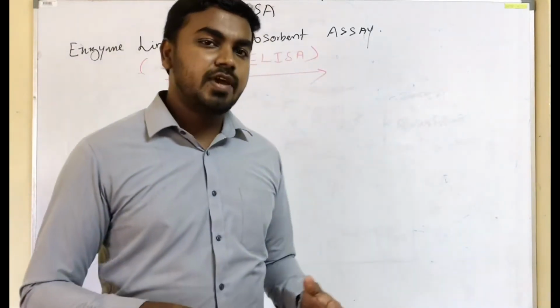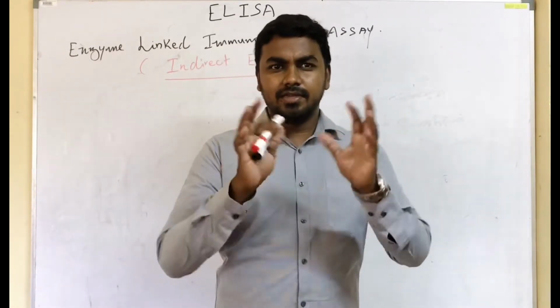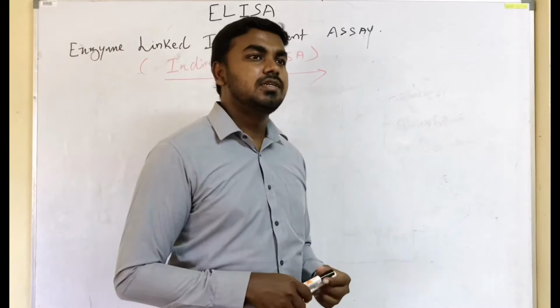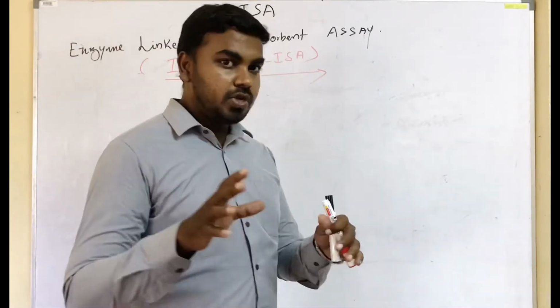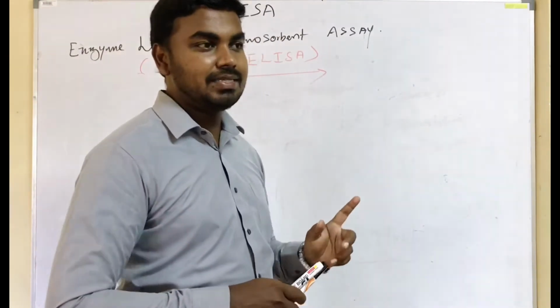In the last video we have seen what is an ELISA. So we have learned a little principle, right? A few things about ELISA, the basic principle. What are the ingredients it has, how it works. So today we are going to mainly focus on indirect ELISA. So what do you mean by indirect ELISA?